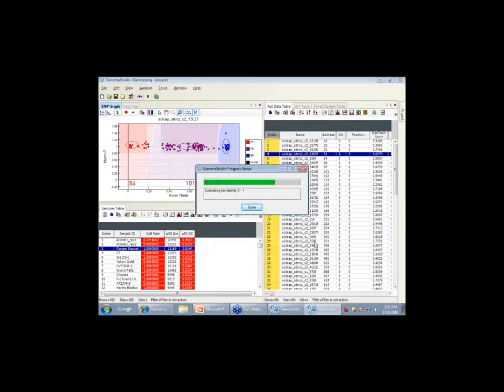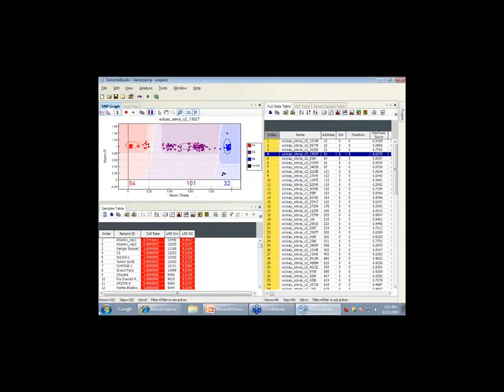We click that. And then if you look on the bottom left, now it's displaying 192 rows. So there used to be 96 samples with 96 SNPs. There's still 96 SNPs, but 192 samples on that. So you now have new samples.